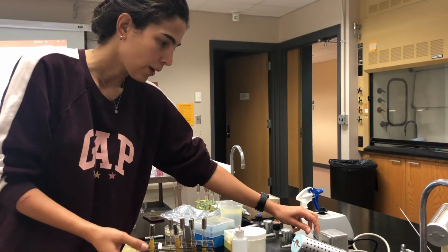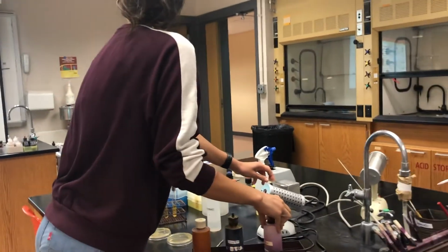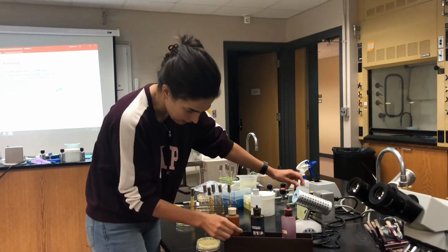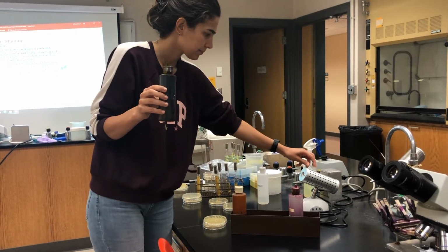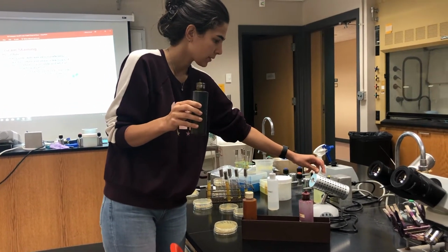Okay, 1 minute is done. Then we need to add crystal violet. So here is the crystal violet. I'm gonna add it.